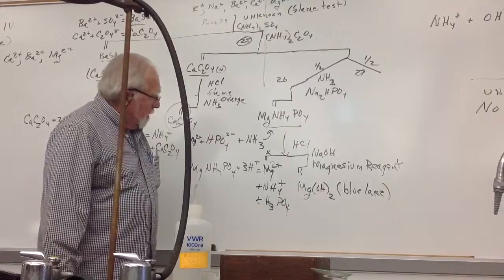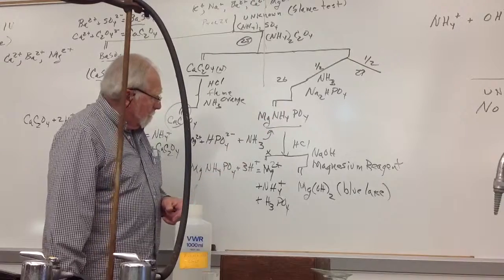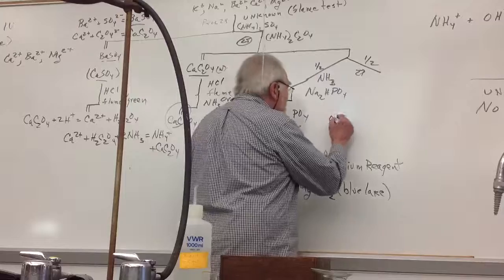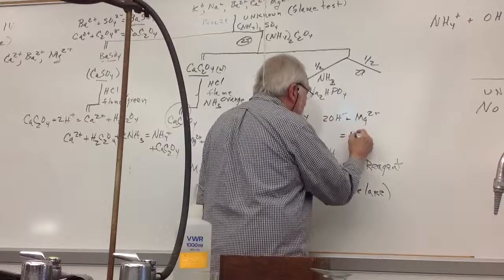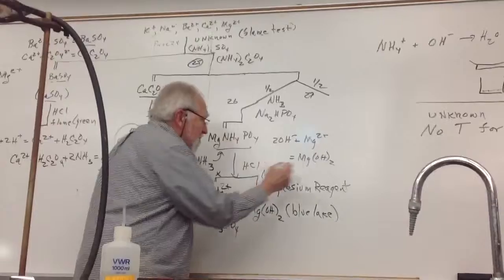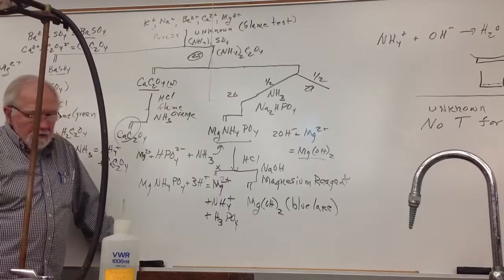Okay. So if you don't get the blue color precipitate, it means that you probably didn't really have this thing back here. Net ionic equation. So there's your precipitate. But it's with the dye absorbed on the surface of that, and you get the blue colored precipitate.